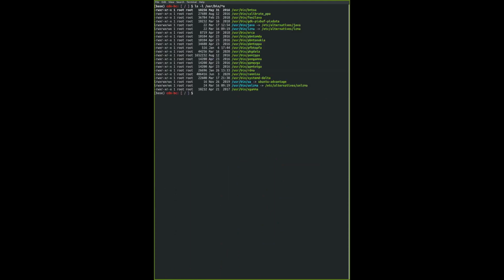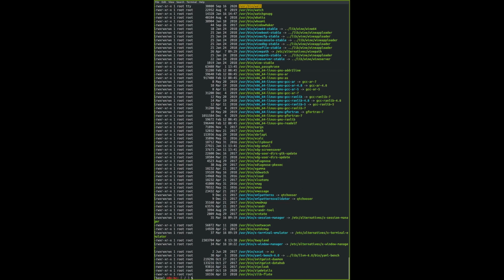And then the next one is a little bit tricky, because, sorry, the second one is not ending with A, it's contain the letter A. So A can be anywhere in the name of the file. So you have to put an asterisk in between, so asterisk A asterisk. This picks up a little bit more files and is a bit more lenient with your file search. So all of these files should have an A somewhere in the name.